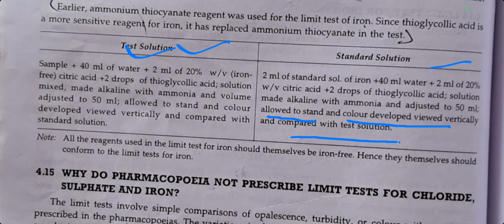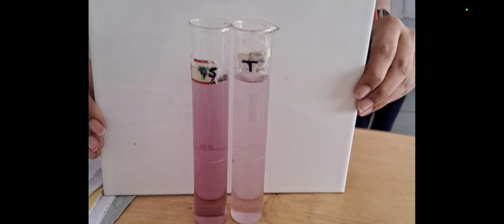So we can compare the color solutions, the color of the test with the standard. This is the test performed for the limit test for iron. We label the cylinders as A and B, or we can call them test and standard.